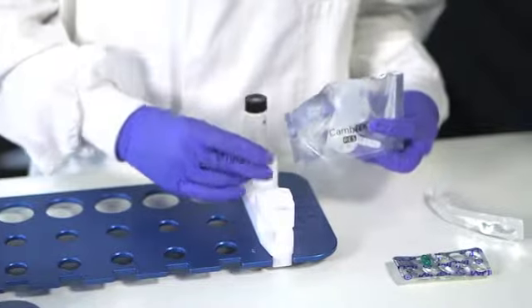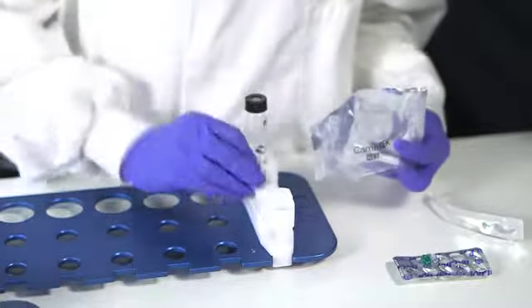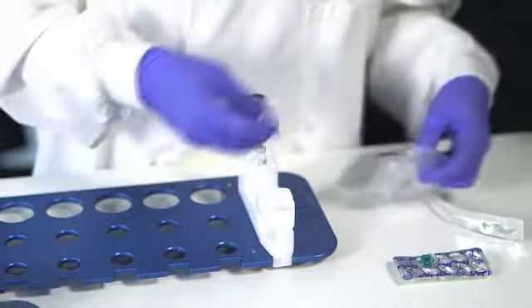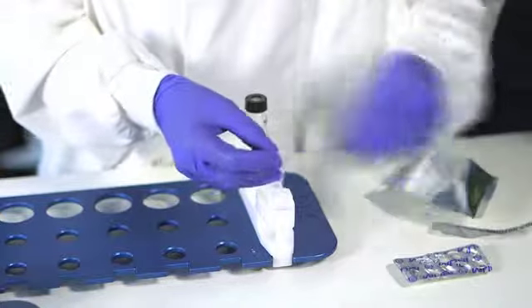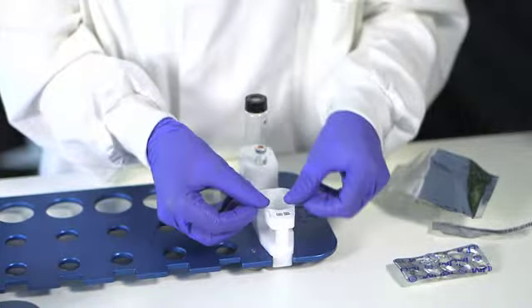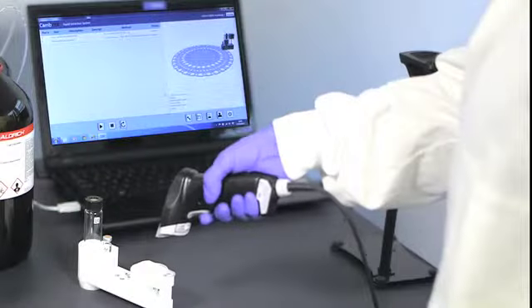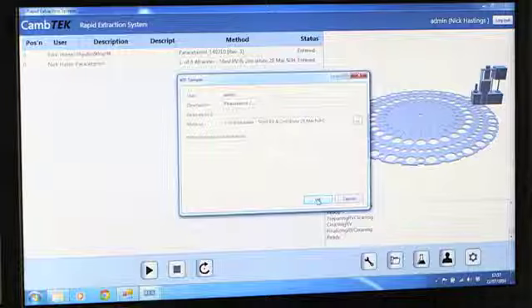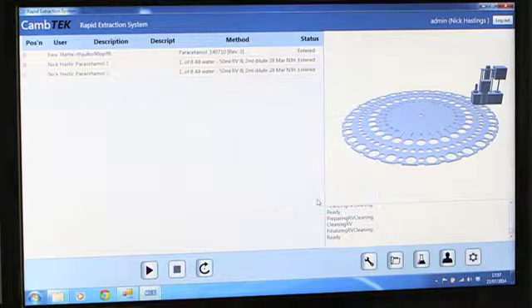The RES is very simple to use, and your samples are prepared in six easy steps. To begin, place the samples into flow cells, load the flow cells into the pucks, then scan and input the sample data. Once the pucks are loaded onto the carousel, just press play and walk away.